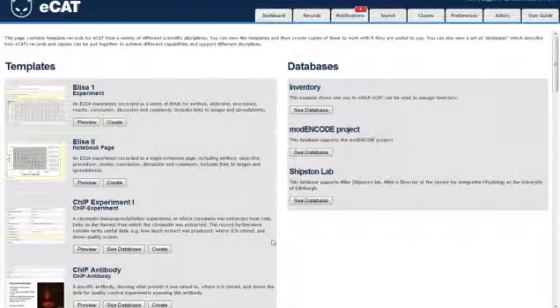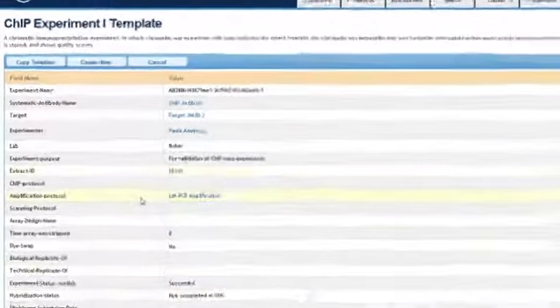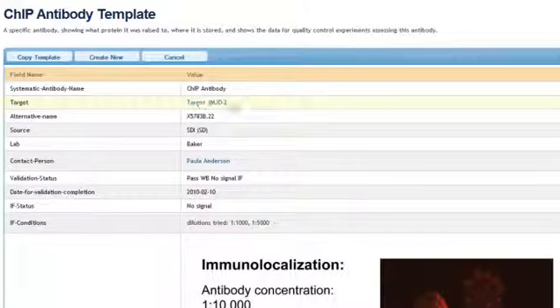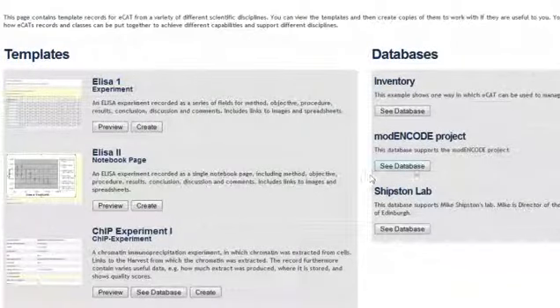You can get even more value from eCAT's structuring capabilities through linking between records. For example, if a set of experiments use antibodies that were also in eCAT, the experiments could refer to the antibodies in which they were used, and it would then be possible to find the antibodies used by an experiment when viewing the experiment without any duplication of data.